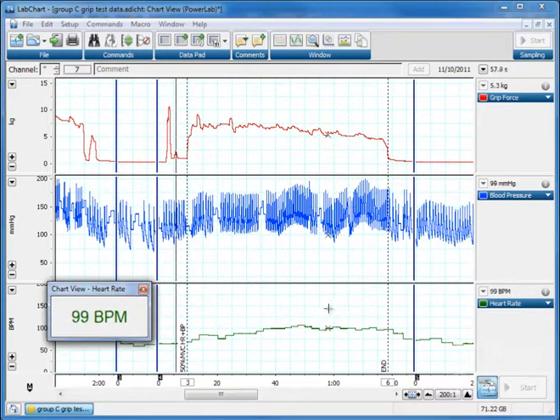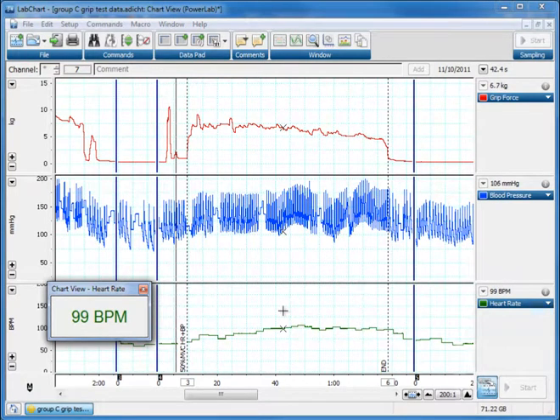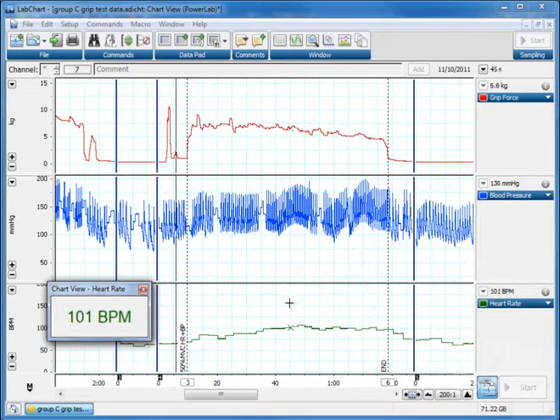This shows you what is happening on the input if you're recording, or if in this case you're doing analysis, it just shows you what the data point is, what the value is at the cursor.